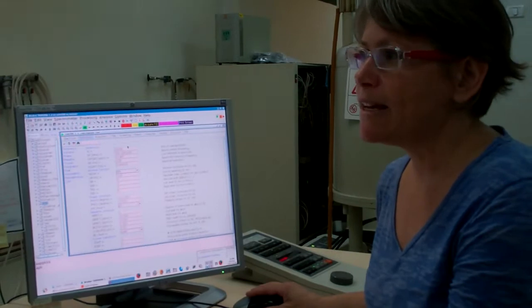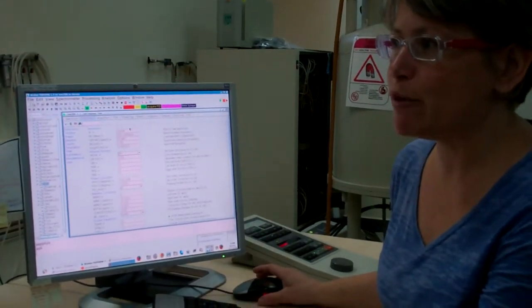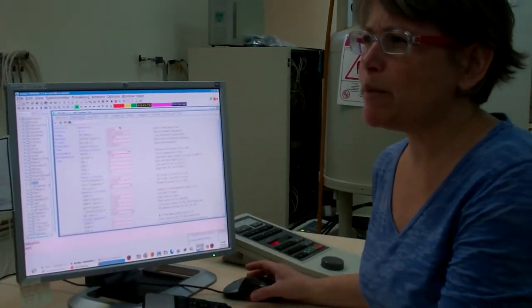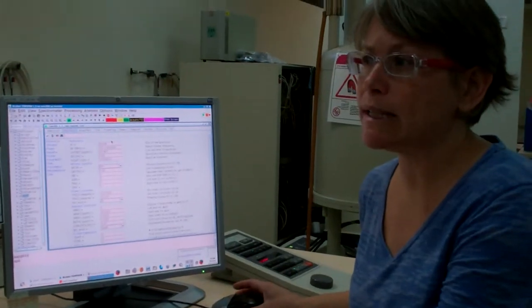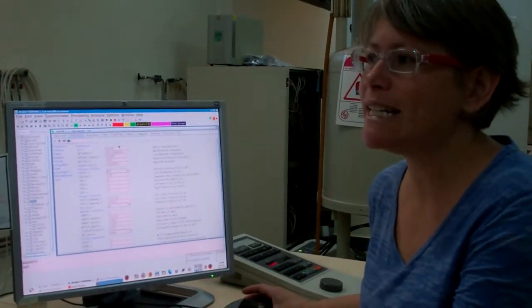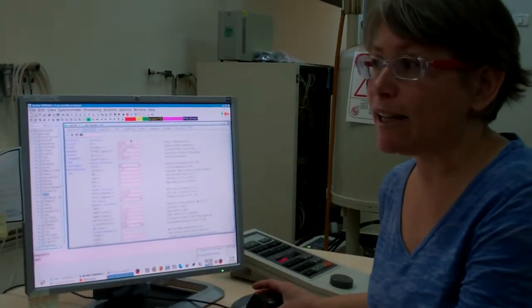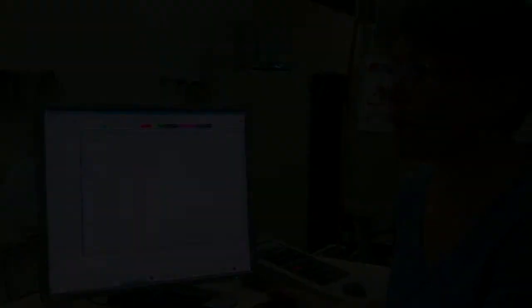One is SI, the number of points in the frequency domain. Do you remember the Topspin parameter name for the number of points in the time domain? It was TD. We set SI larger than TD for zero filling.